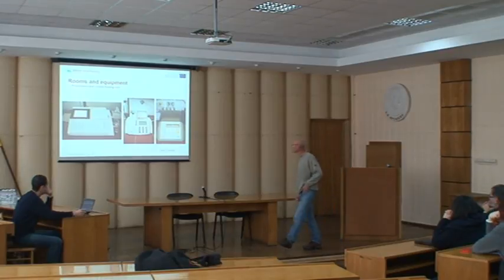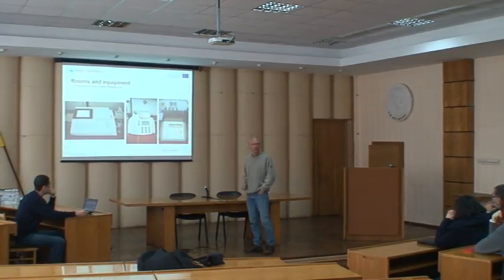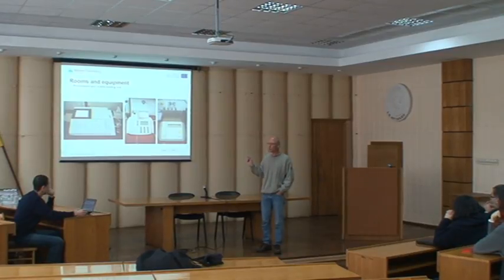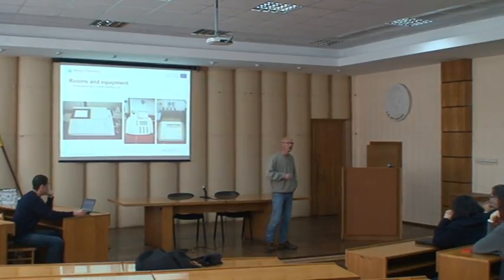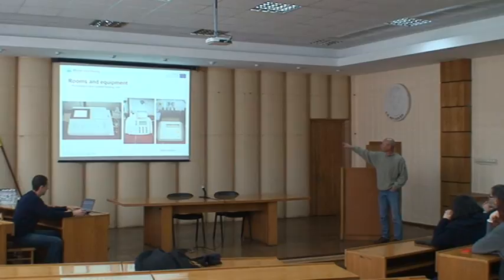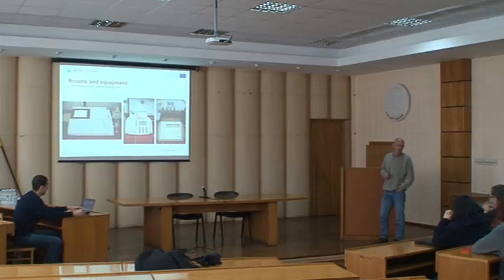Here we have some photometers, a big one on the left-hand side, which can do a scan with, I think, 1 nanometer spacing. So you can do delicate analysis with these. In the middle, you see a normal photometer which has been used for round cuvettes. For this fast determination of, for example, COD or phosphate or nitrate or something like that.